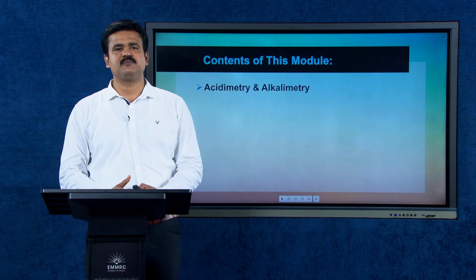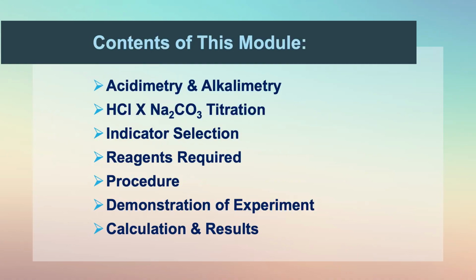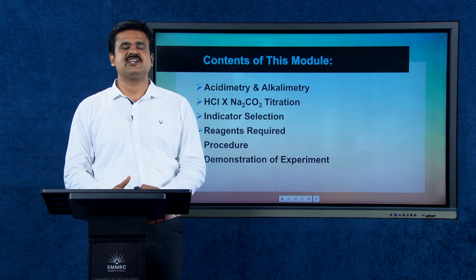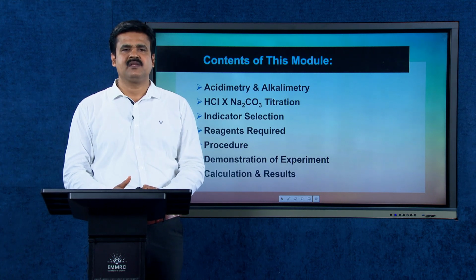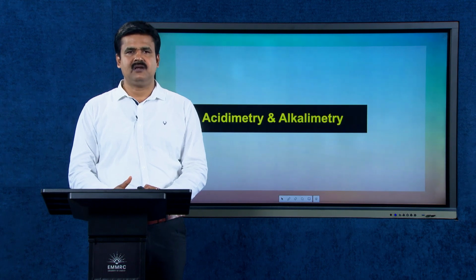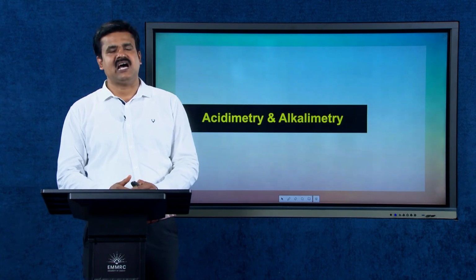The contents of this module are acidimetry and alkalimetry, hydrochloric acid against sodium carbonate titrations, indicator selection, reagents required for the experiment, procedure, demonstration of the experiment, calculations and final results. First of all, acidimetry and alkalimetry.